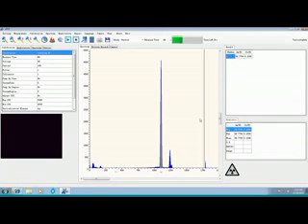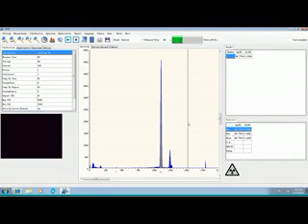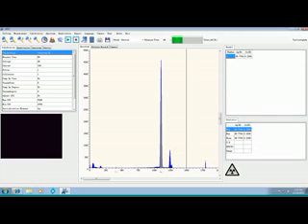Okay, now the machine has completed its warm-up and at this point we want to take readings on our samples. That's what we bought this machine for.